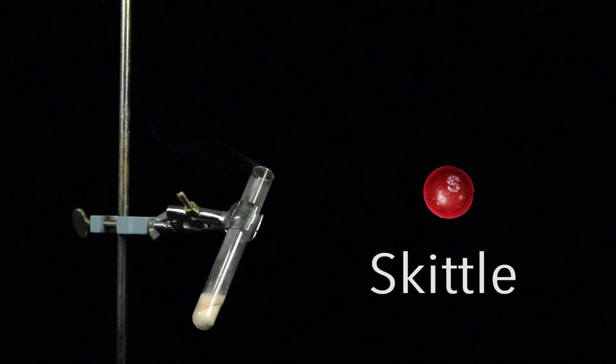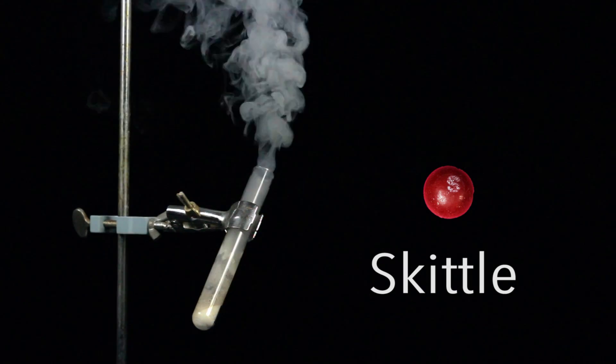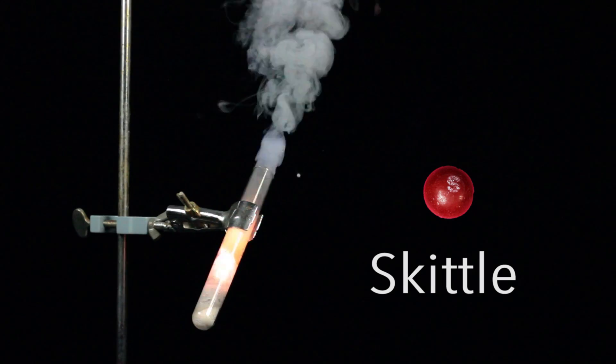You can experiment with all types of candies. But be careful, potassium chlorate is extremely dangerous. So make sure to use the proper safety procedures.